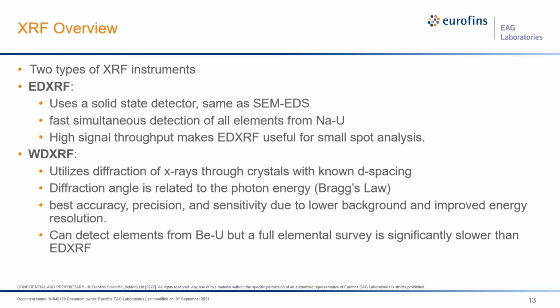In our Sunnyvale lab, we use only WDXRF instruments. However, in our lab in the Netherlands, we also have an EDXRF along with WDXRF for small spot analysis.